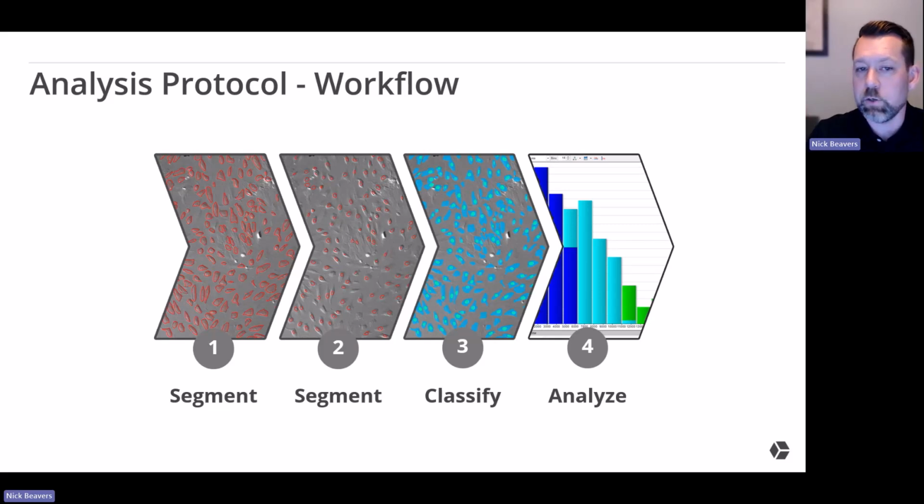Now, I could do this 3 or 4 more times. I could find all types of subcellular material. I could look for mitochondria in here, and I could look for anything. I could use non-cellular images, and I could look for all different types of materials, different classes of objects. And so I can run as many AI models back to back as I want.